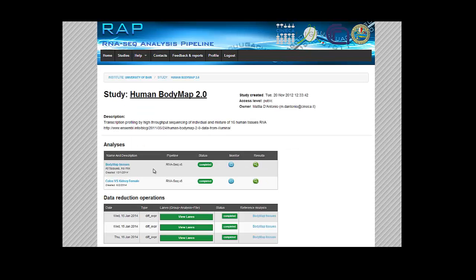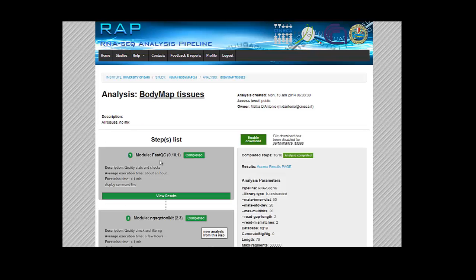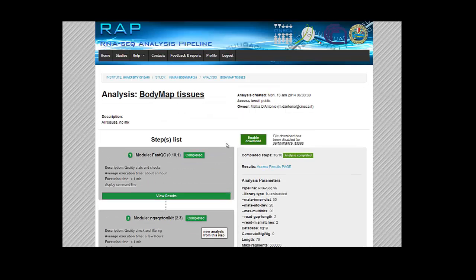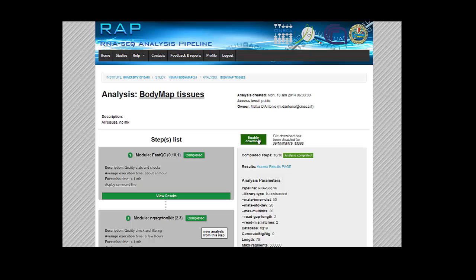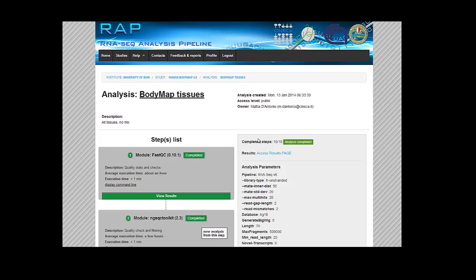Well, here we have a lot of files, and we're going to click the Enable Download button. This is when we have a lot of samples—for performance issues, the download option has been disabled. We can re-enable it. Okay.